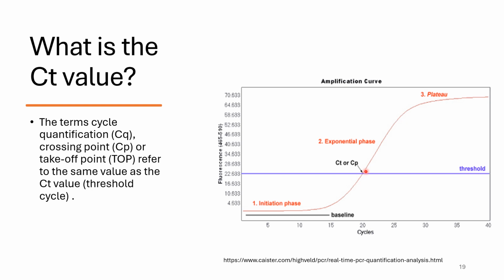In order to calculate the CT value, it is necessary to draw a horizontal line, the threshold, on the amplification plot. The placement of the line is often determined by the qPCR software. However, users can manually place this line. Ideally, the threshold is placed at a point when the reaction is in the exponential phase. Therefore, it will not be confused with the background signal.